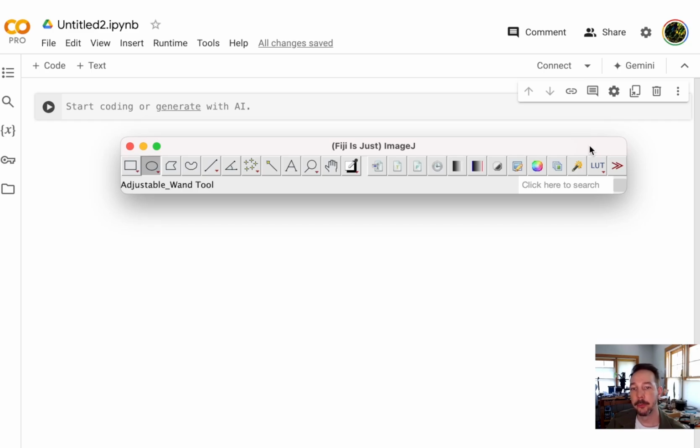There are ways to do it in Fiji as well, which we'll cover in later workshops, but it's very efficient to use these new tools within Python, and it allows you to do things in a high throughput manner. And so you can tie it in with your big data, you can use these deep learning tools, you can use other segmentation and analysis tools, and then you can have your plotting and statistics all together in one processing script.